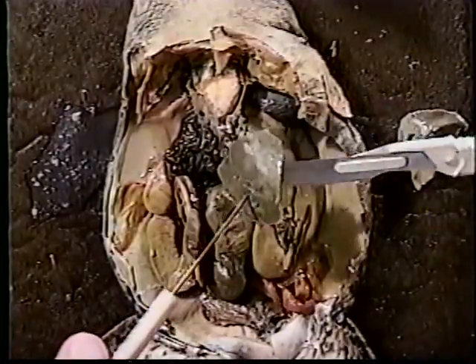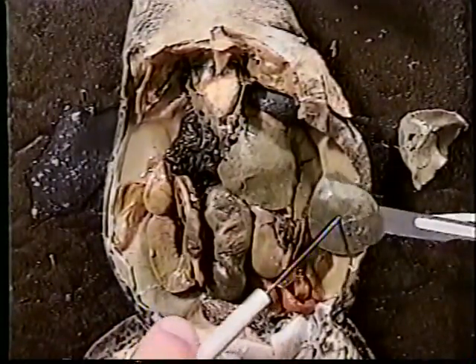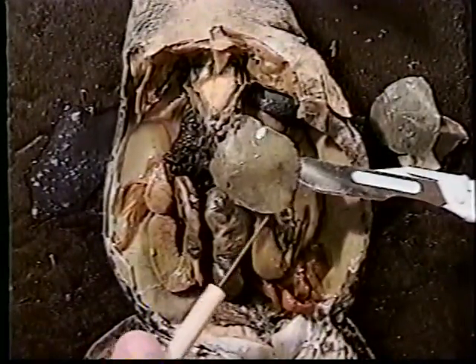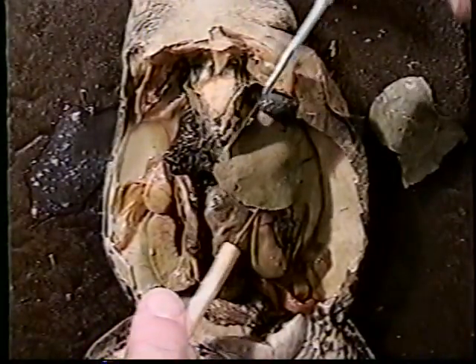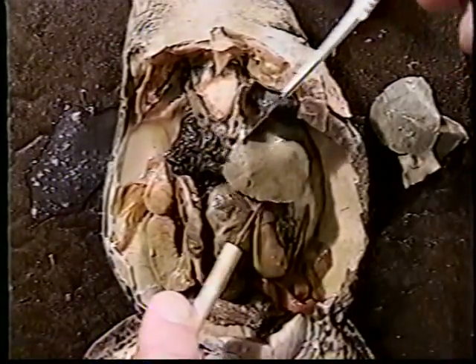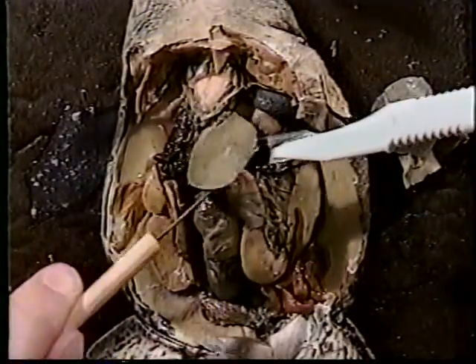Always keep in mind, it's better to be slow than fast. And finally, so we can get a real clear view of what lies beneath these large livers, I'll remove the third. And then I will give you a cross-section look.